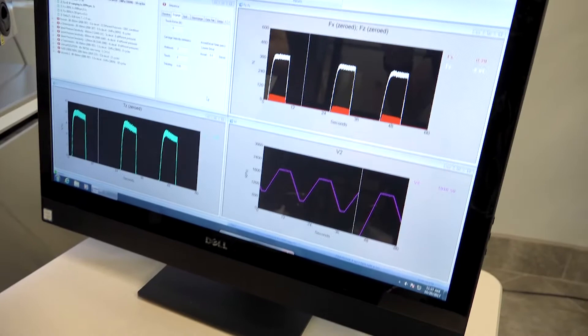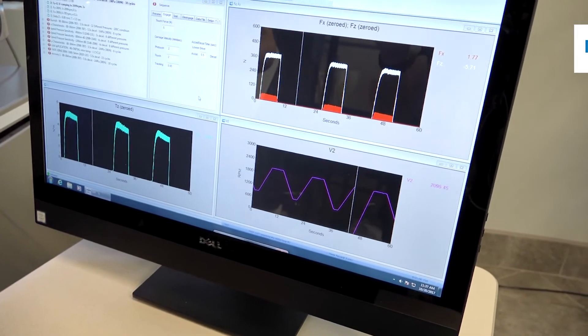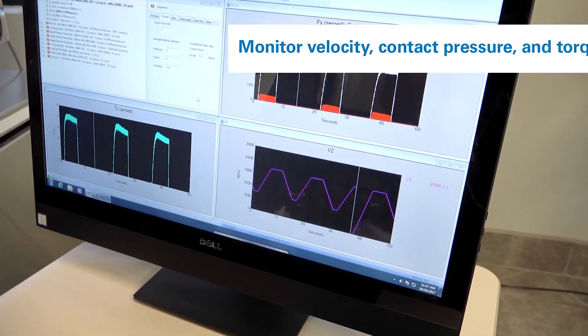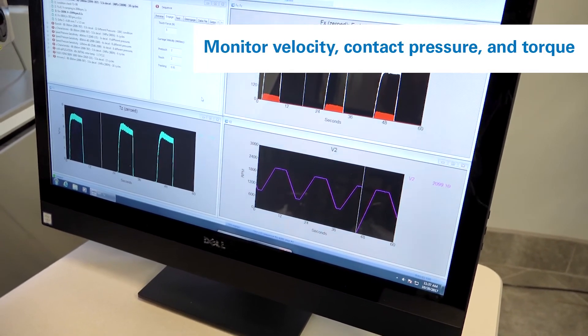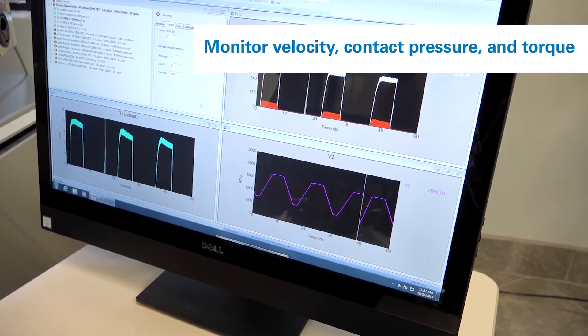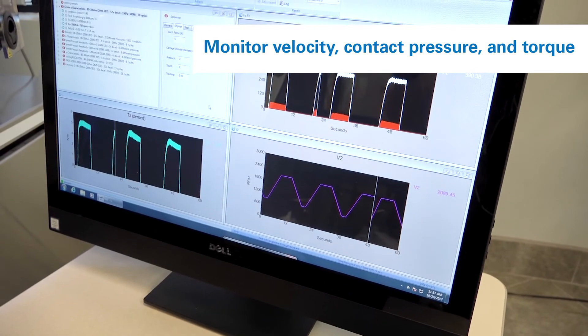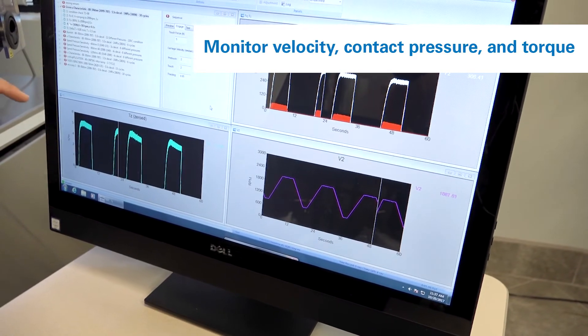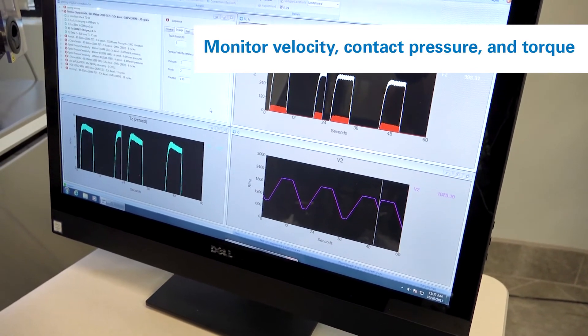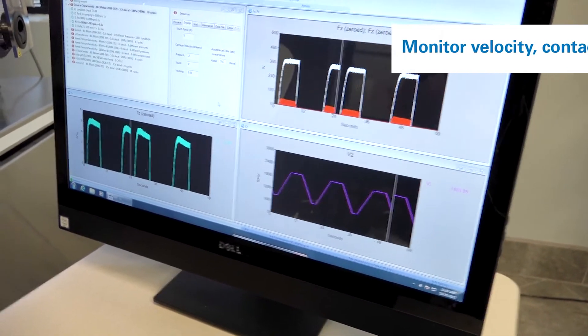While this happens, in the software we can monitor the velocity, the force that is applied, and importantly, the torque that is generated.